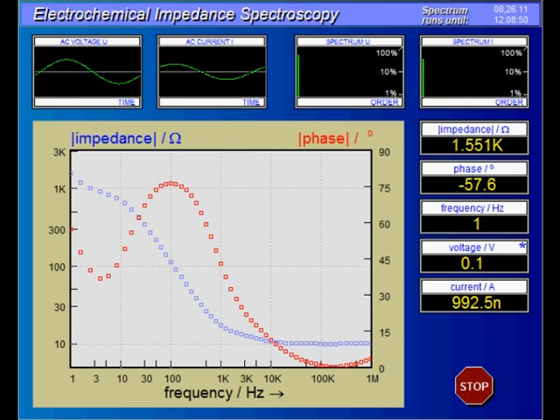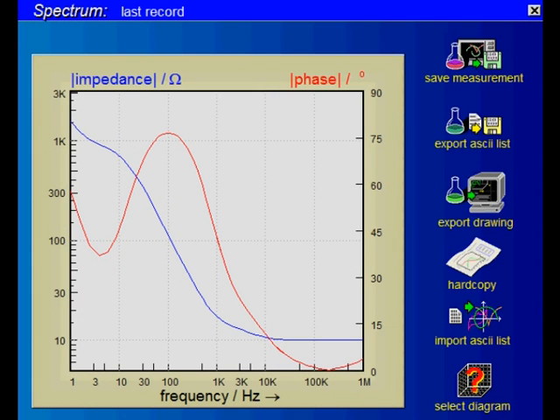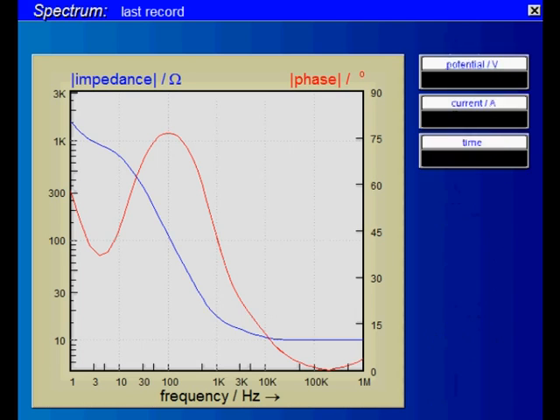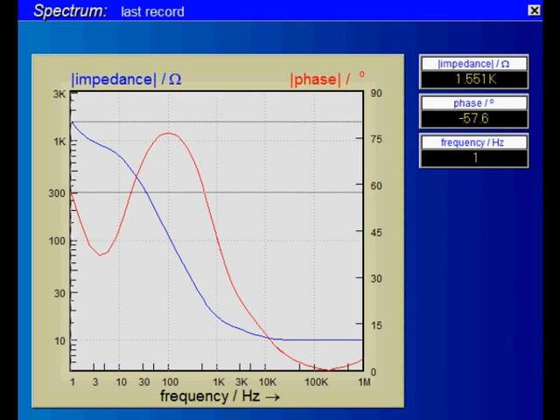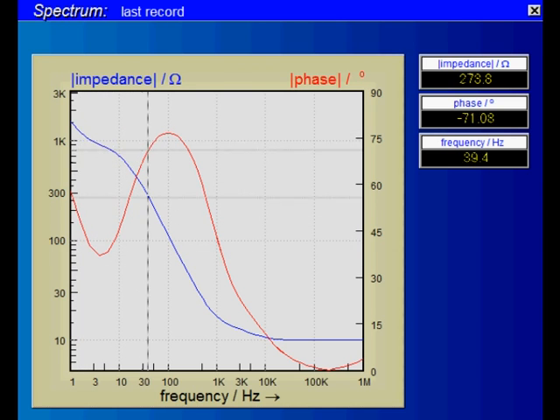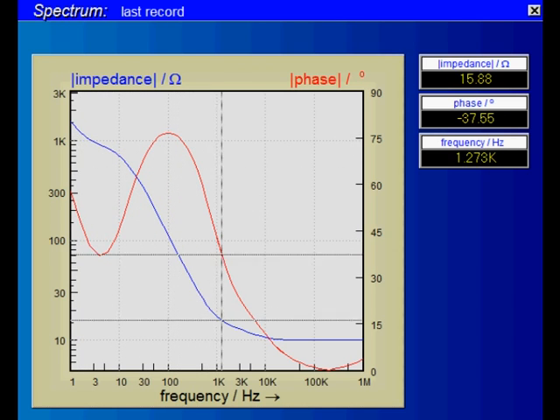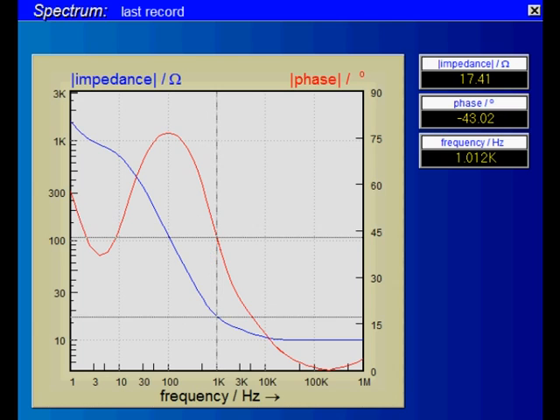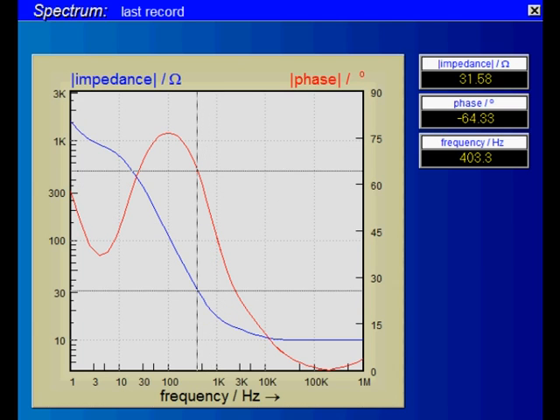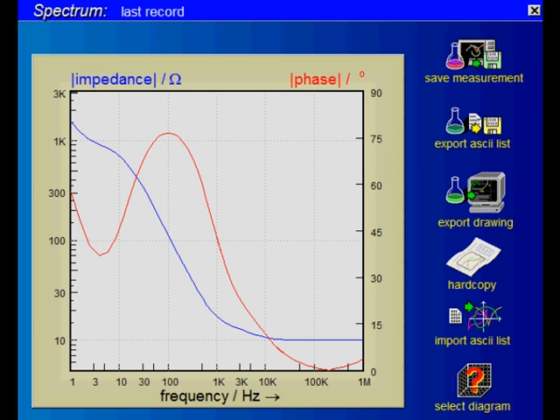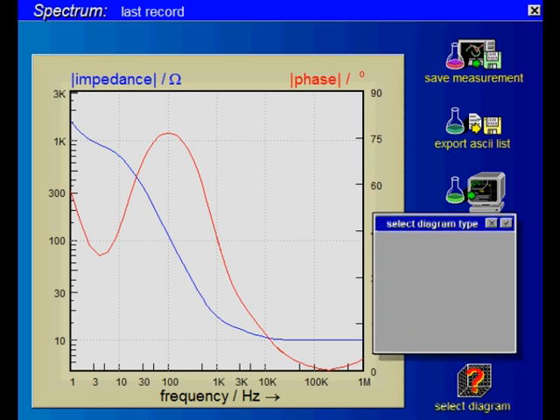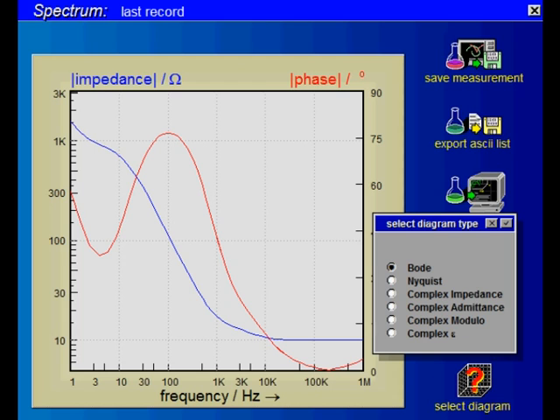After the measurement is finished, the spectrum is displayed. Clicking on the graph allows you to go through the curves using a crosshair cursor, and the values of the selected point are shown on the right-hand side. The display can be switched between Bode, Nyquist, and several other standard graphs.